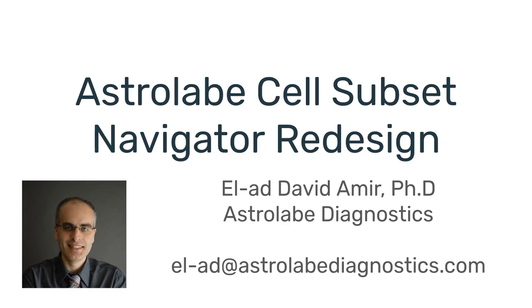We're releasing a complete redesign of the Cell Subset Navigator. When dealing with high complexity flow, there is a lot of information to deal with. There are many different cell subsets, many different covariates, and research questions that you want to ask.